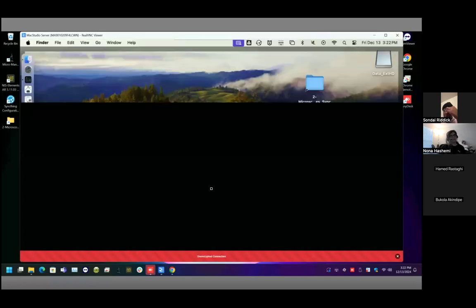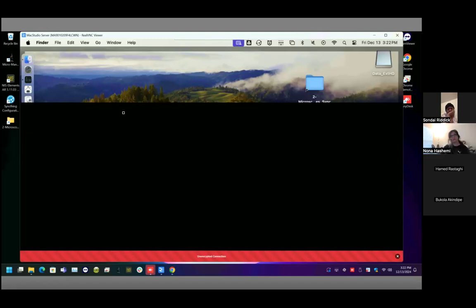Whenever you want to perform further analysis or use any tool which is not currently present on the microscope computer, you have to remotely connect to the server computer and do whatever you want to do. But the data set you need is already synchronized.